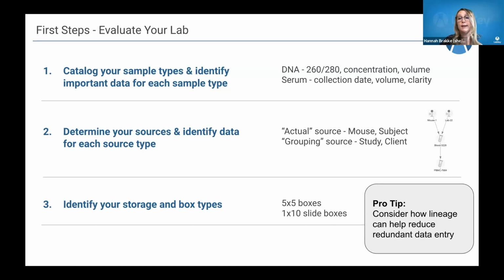is what redundant data do you have? So if you're looking at your Excel file and you capture information about a patient, and then the study that patient is part of, perhaps that's redundant data that you only really need to enter into Sample Manager once. And so getting that structure to help reduce that redundant data entry will really clean things up in the long run and make it a lot easier on your lab scientists, who then don't have to go traipsing through and capturing all of that information at every single step.